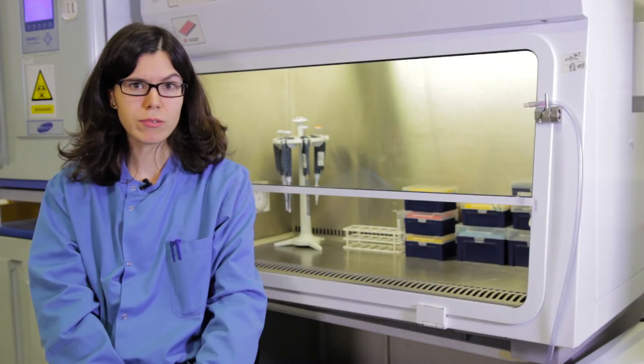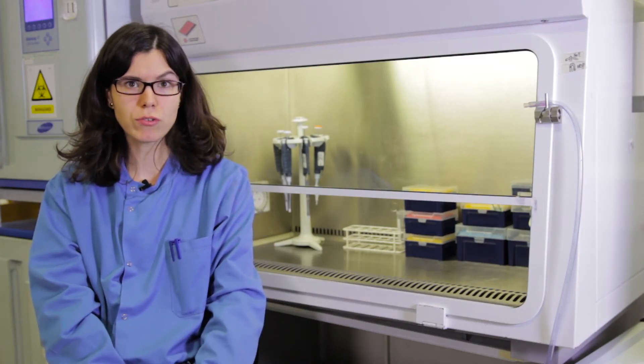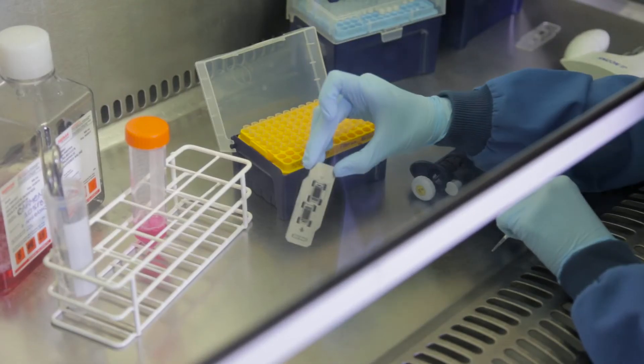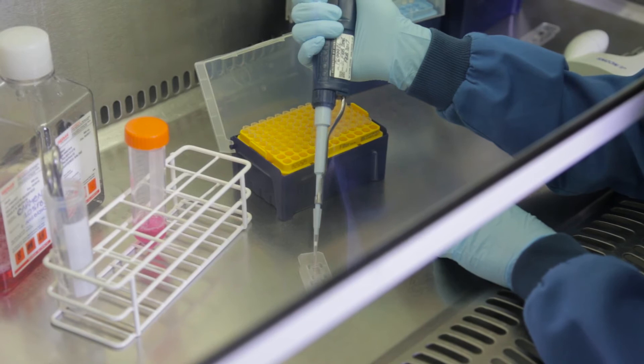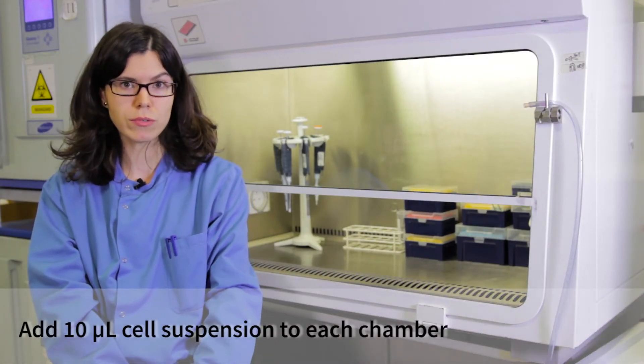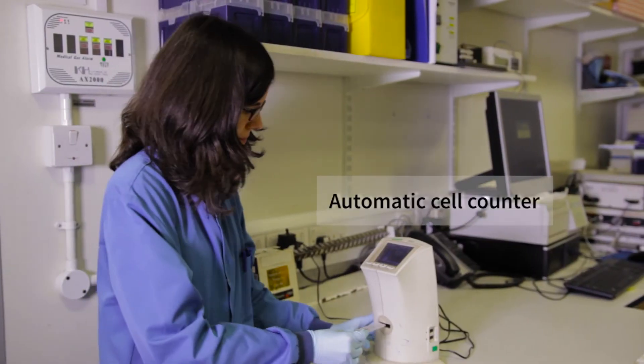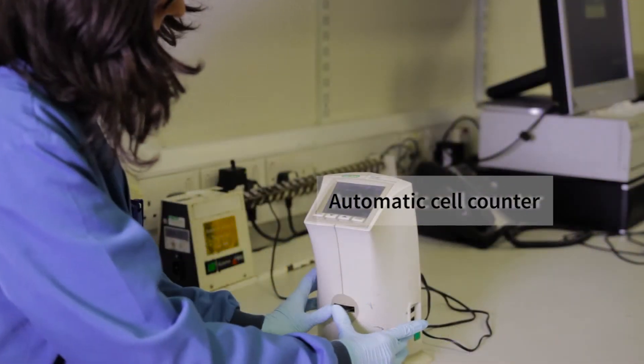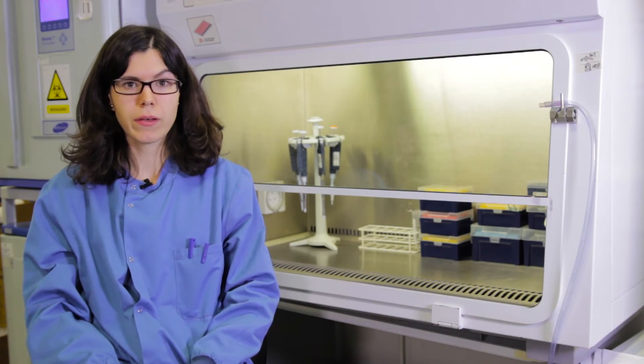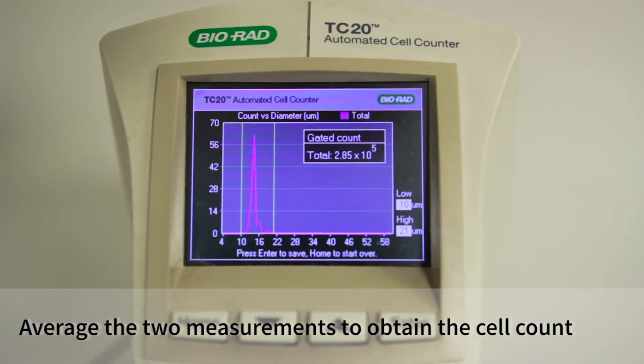Once we have neutralized the trypsin, the next step is to count the cells using an automatic cell counter. To do that, we use a special slide that contains two chambers. I add 10 microliters of cell suspension to each chamber. This is an automatic cell counter. I introduce the slide and it will count the cells in both chambers. We can then make the average between the two measurements.